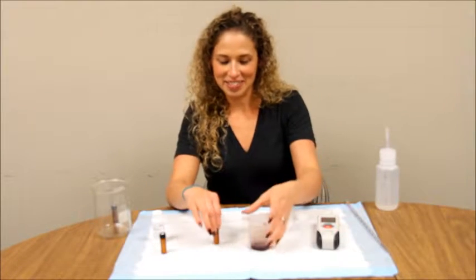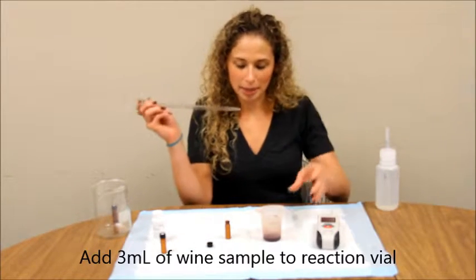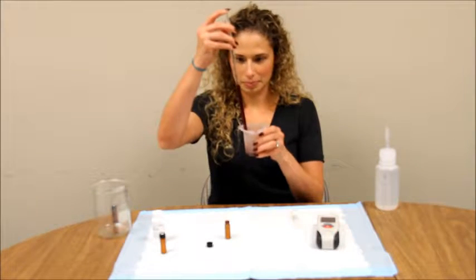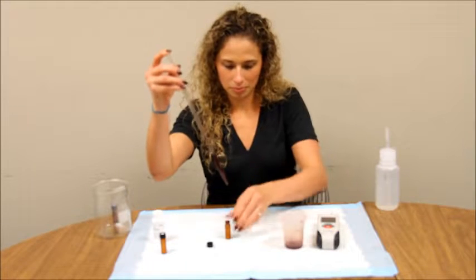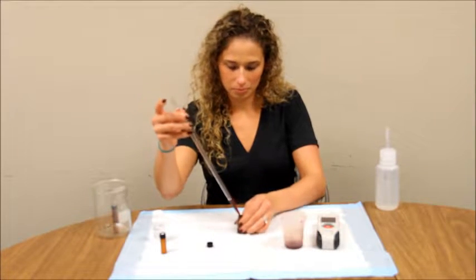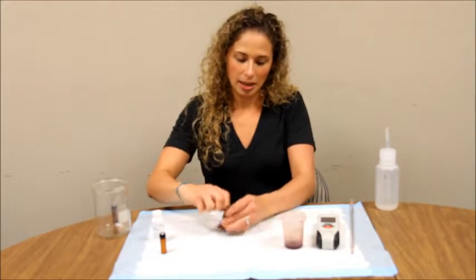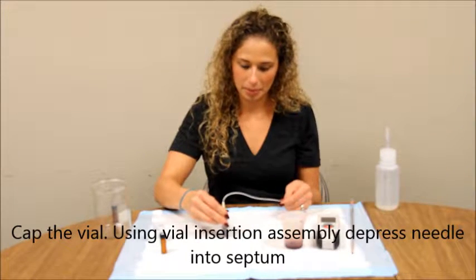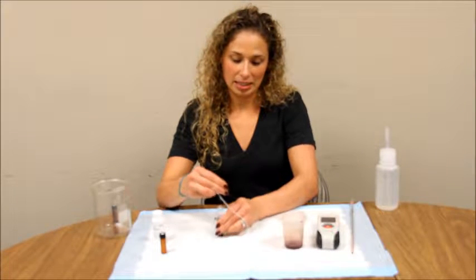Now you are going to add 3ml of your wine sample using your 10ml pipette into your reaction vial. Cap the vial, and with the vial insertion assembly, depress the needle into the septum. This equilibrates the pressure inside the vial.